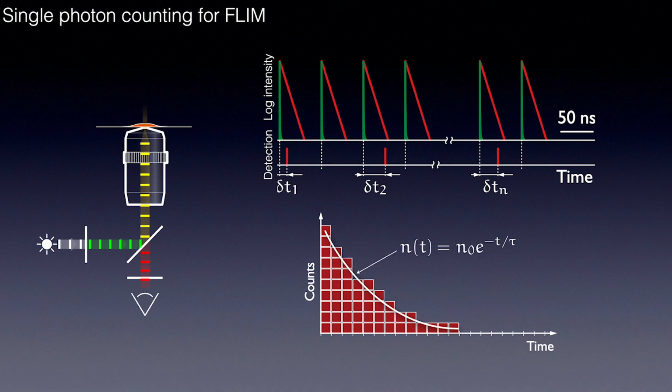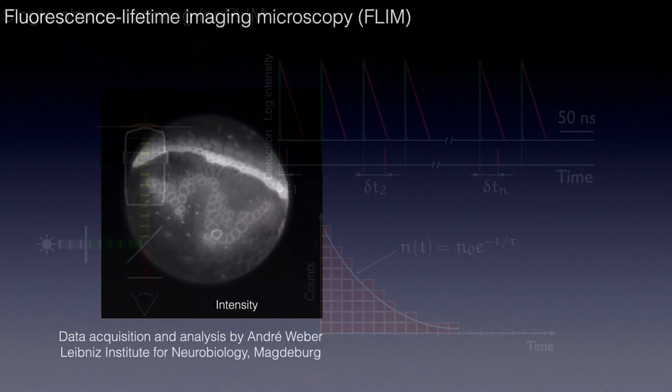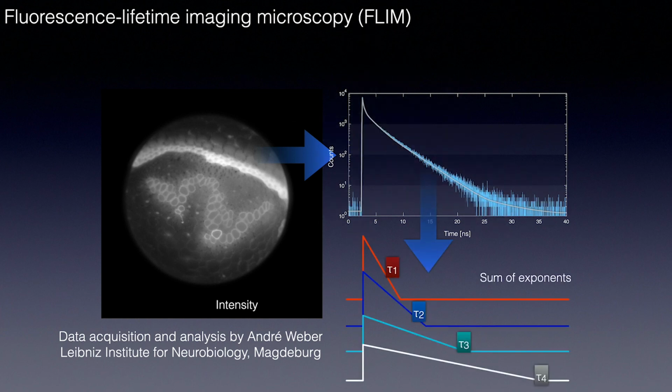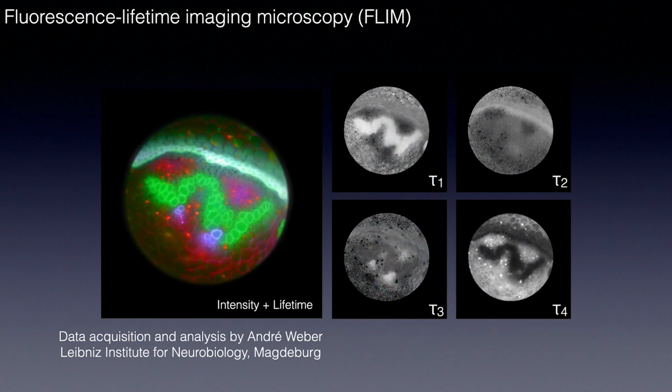This is a basic principle of measuring fluorescence lifetime by photon counting. Here we built a timing histogram for all the photons we acquired wherever they came globally, and we use statistics to resolve the individual components. However, we know the positions of the photons, thus we can retrospectively do a local mixture resolving of molecular composition. This is basically an idea of global analysis.